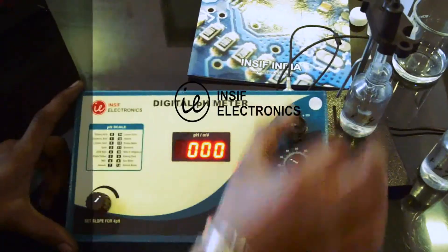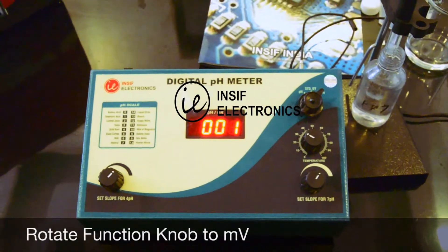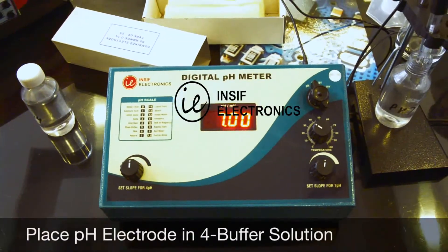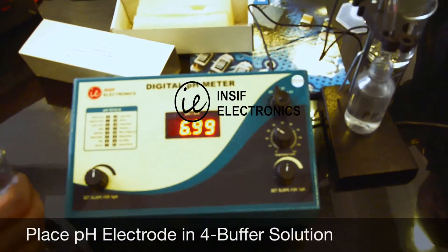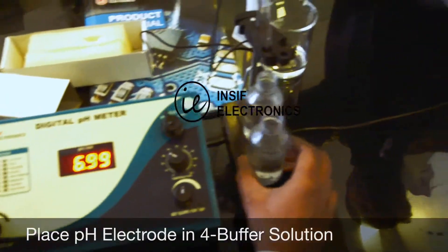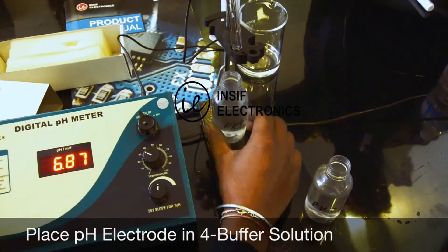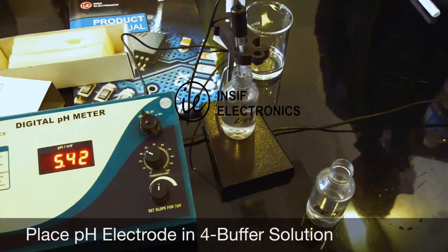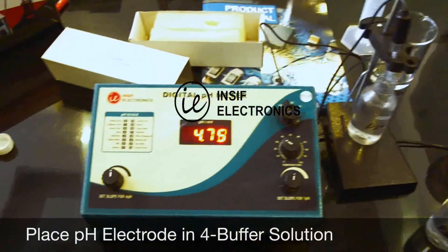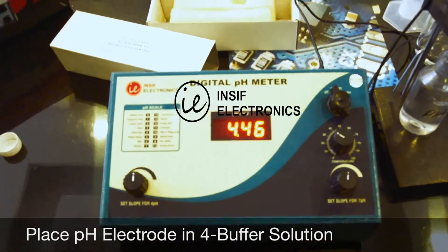For measuring millivolts, rotate the function knob towards mV and the display will show millivolts. Clean the electrode in distilled water, then pick up the electrode, place it on the stand, and dip it into the other solution bottle. You will see the display will show some values — don't worry, it's going to take some time for the display to get stable, so wait till it stabilizes.